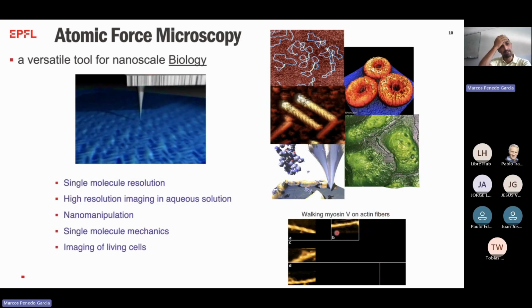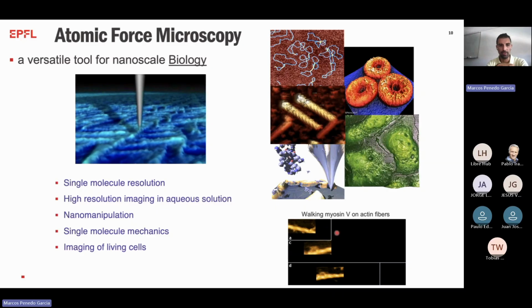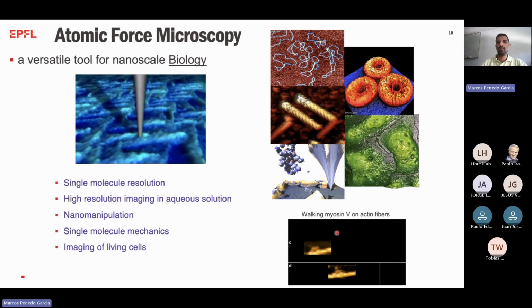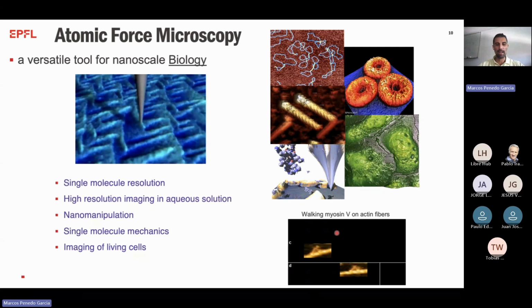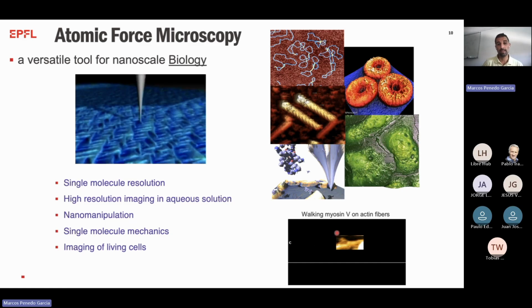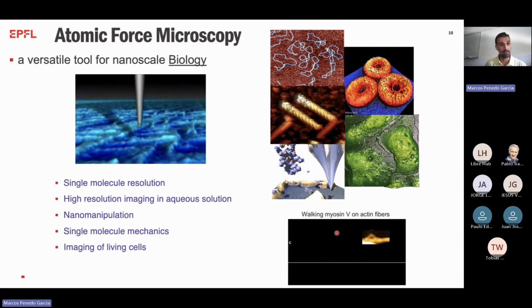Okay, and the versatility of this tool is because you can use it in vacuum, as I showed in the previous video, inside an SEM, in air, and also in liquids. It's independent of the medium. It's a huge range. If you don't use a medium that can corrode any of the elements of the microscope, the AFM will work there. So that is great for biology. You can see here examples of different molecules from DNA to viruses, or cells, bacteria you can image with the AFM.